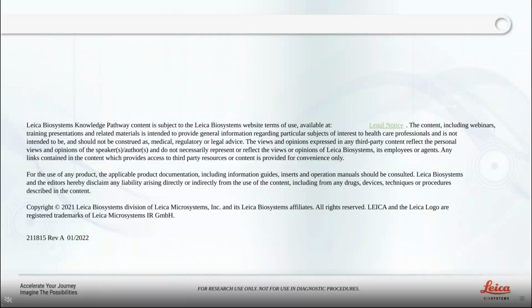And then, there are labs in science that are, for the most part, open to share protocols and even allow shadowing experiences. That could be another option. Or another option will be to see if your institution has any histology or imaging core facilities. Usually the staff at core facilities are very knowledgeable on sectioning protocols and could be able to assist in the process. The research field nourishes a very collaborative environment, and you may find support at your own institution as well.